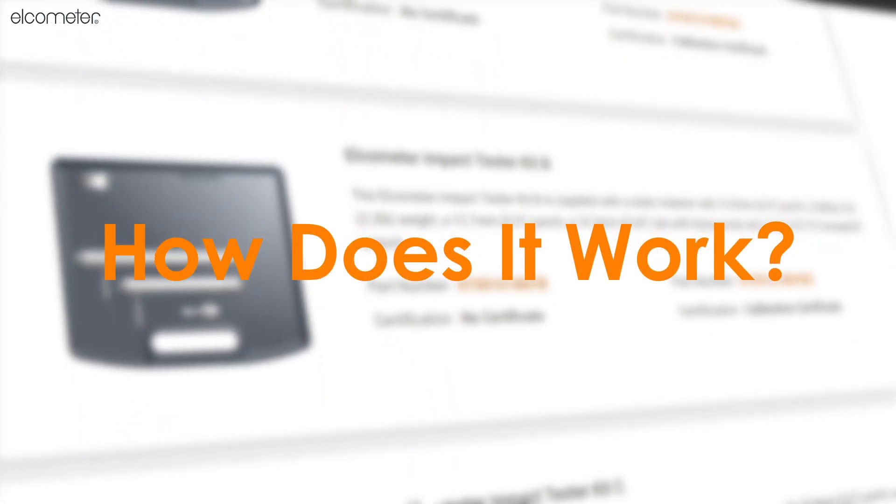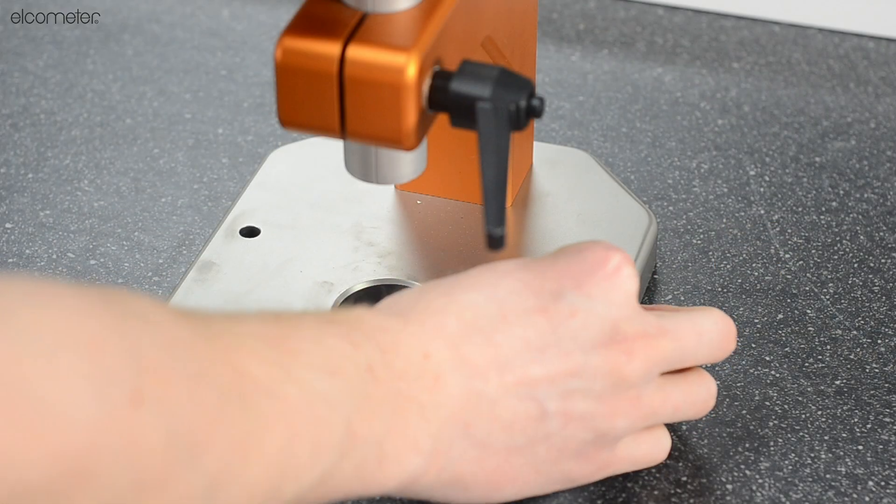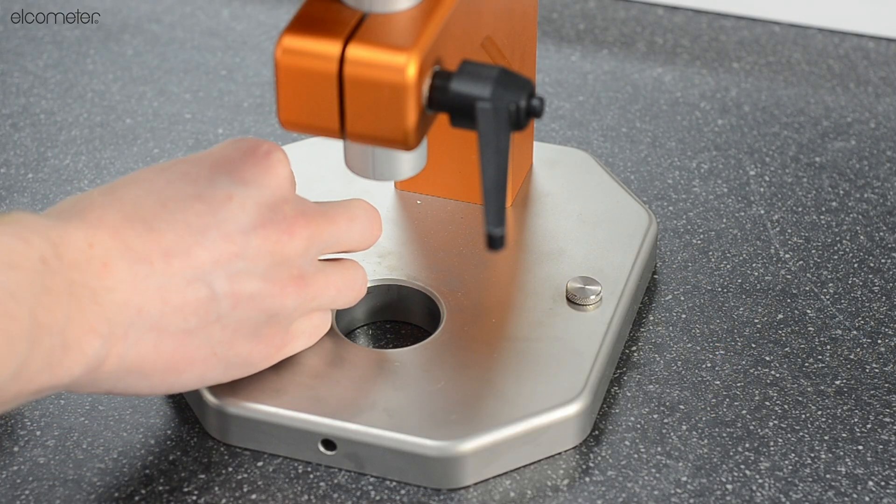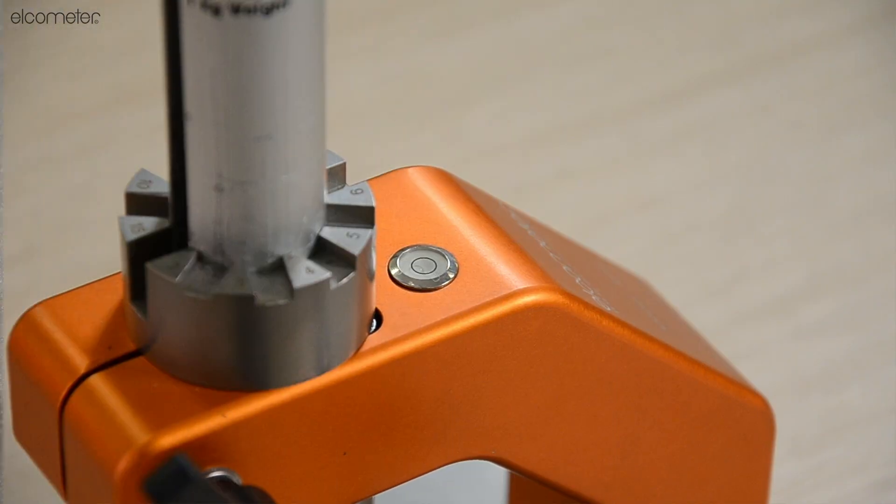So how does it work? Once your tester has been safely secured to a stable surface, make sure it is level using the built-in bubble leveler.